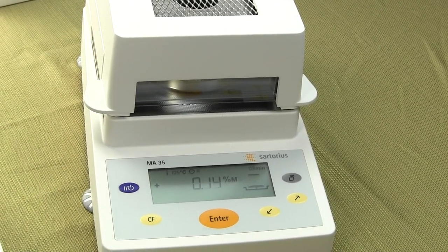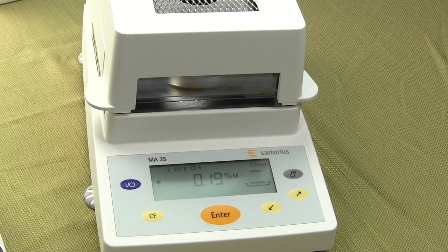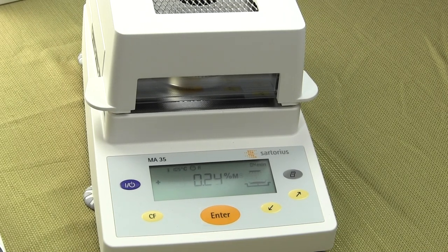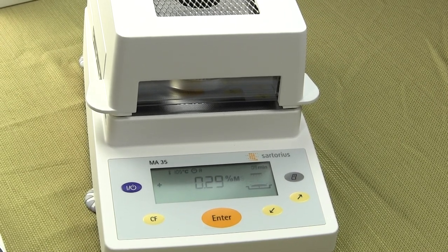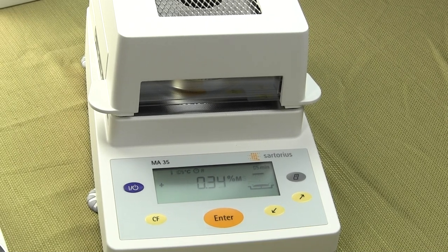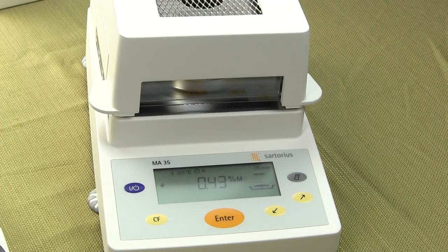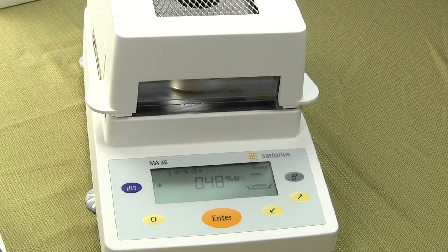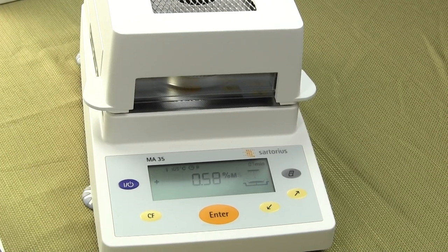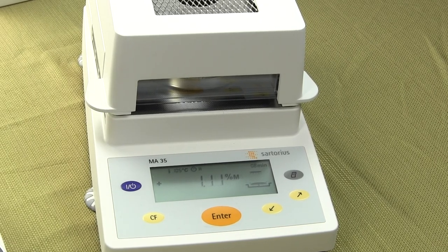Let me go over some of the other features while the moisture balance is running. The Sartorius MA35 is a basic, user-friendly moisture balance with one milligram resolution and a standard RS232 interface. You can increment the temperature in one degree Celsius — many competitive models only allow five degree increments. The Sartorius offers one degree increments with a temperature range of 40°C to 160°C.